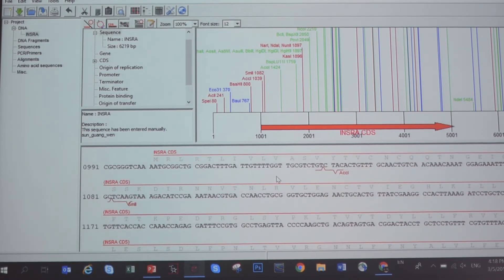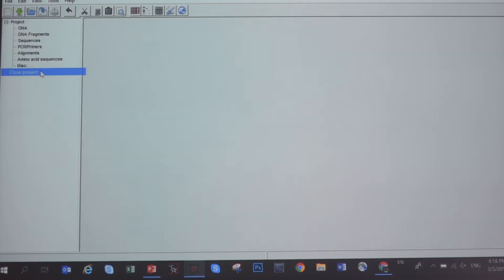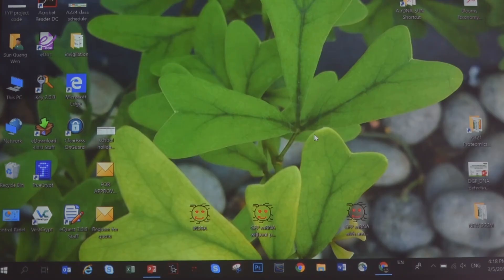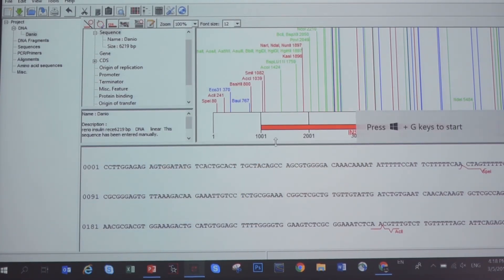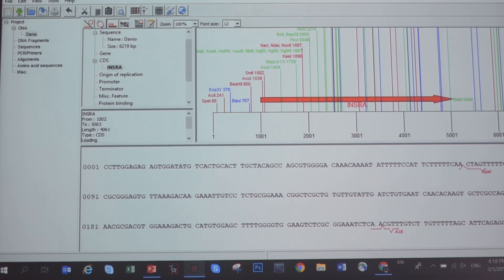So this is how you enter a new sequence. Now you can close this project, and I will show you how to open a pre-made molecule. I have a pre-made molecule like this — just double click and the sequence will show up. This is the exact same molecule I made previously. This is the end of this demonstration.